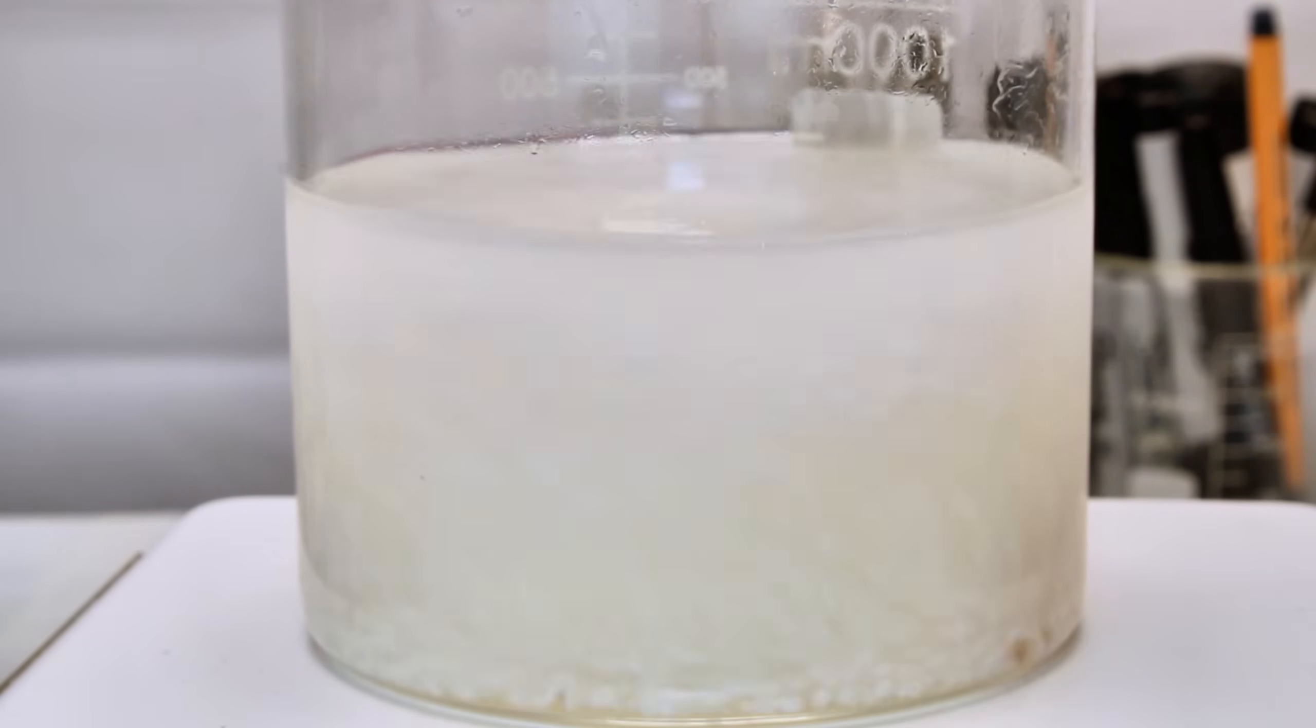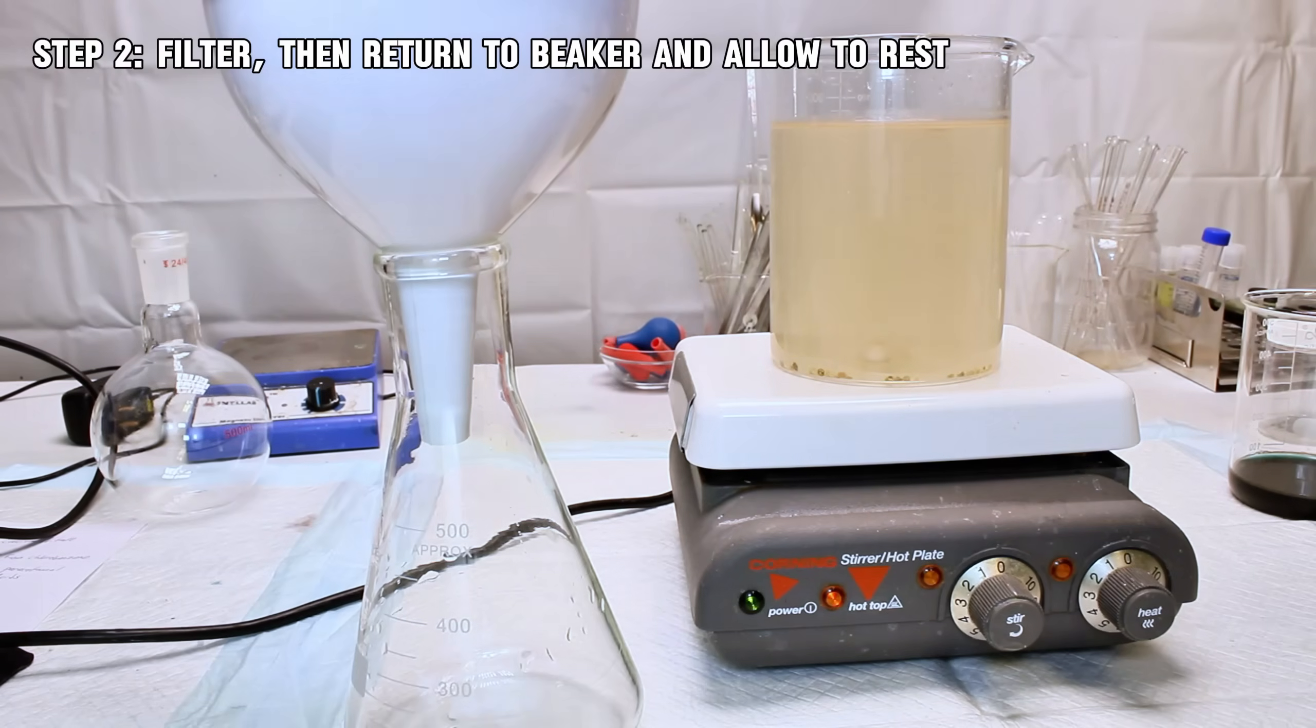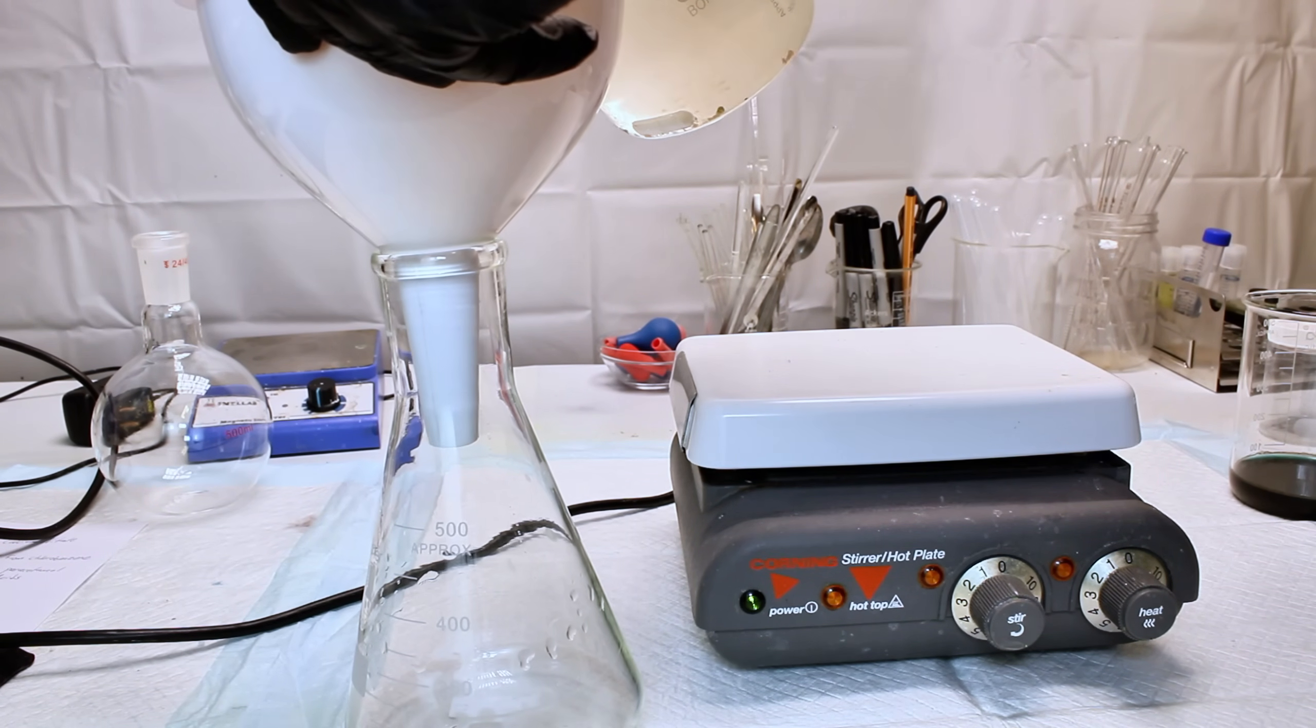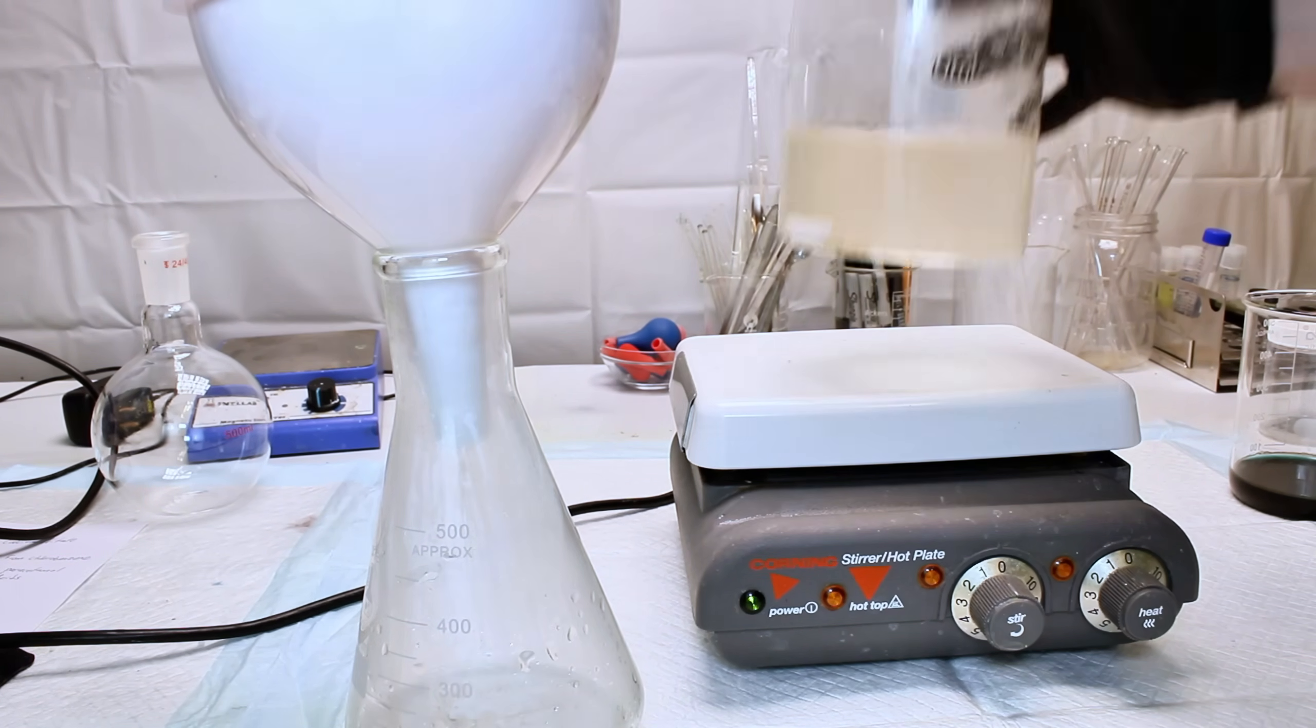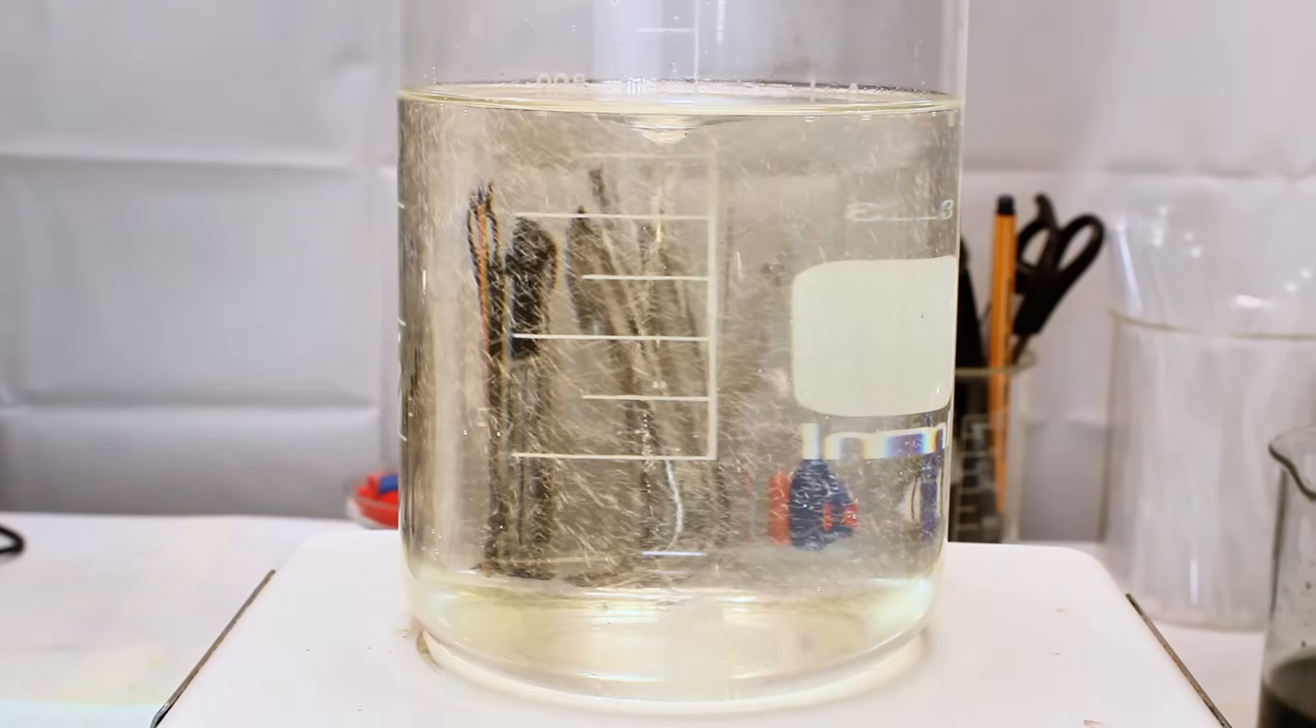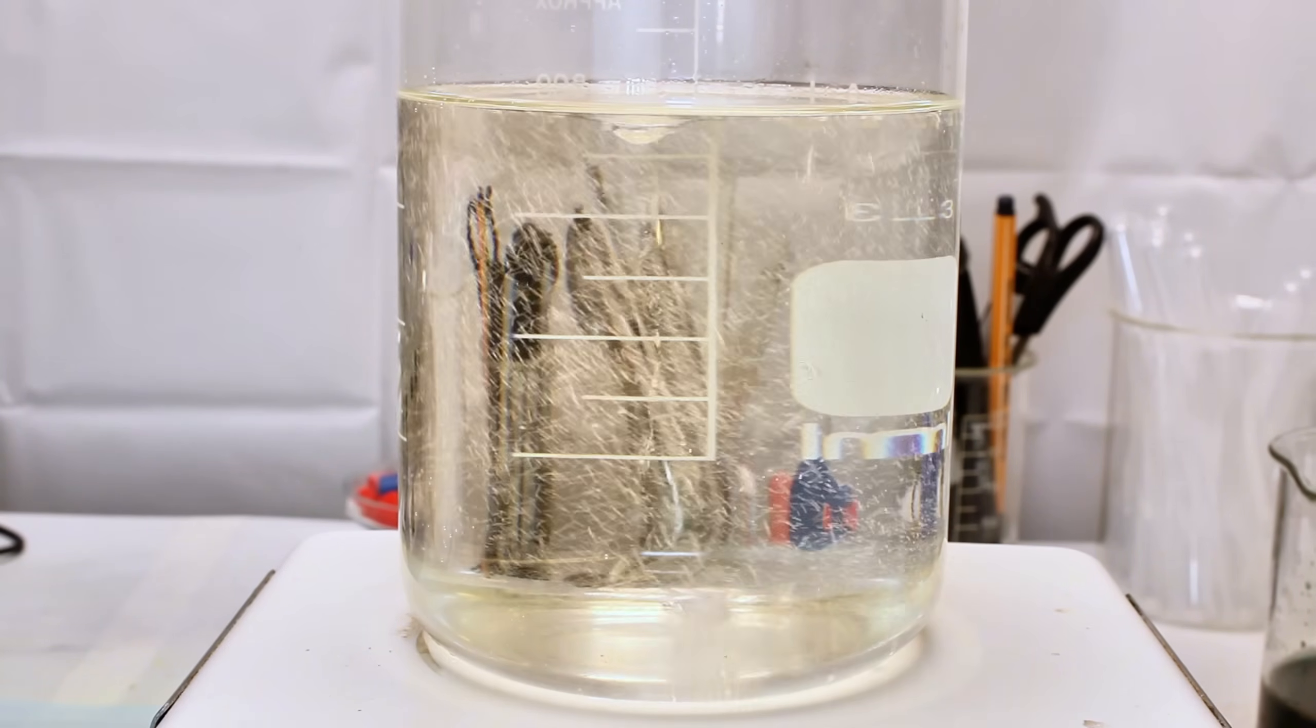Once all the urea does dissolve, I add more and repeat until I'm out of space in my beaker. At this point, I pour the still hot urea solution through a coffee filter to remove the oily brown crap that seems to be a staple in all of these fertilizers. The filtrate is then returned back to a fresh beaker and quickly heated back to boiling before taking it off and allowing it to cool.